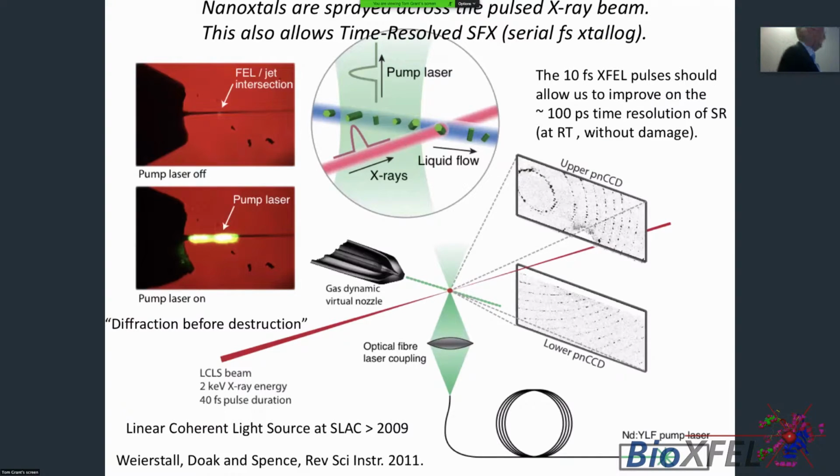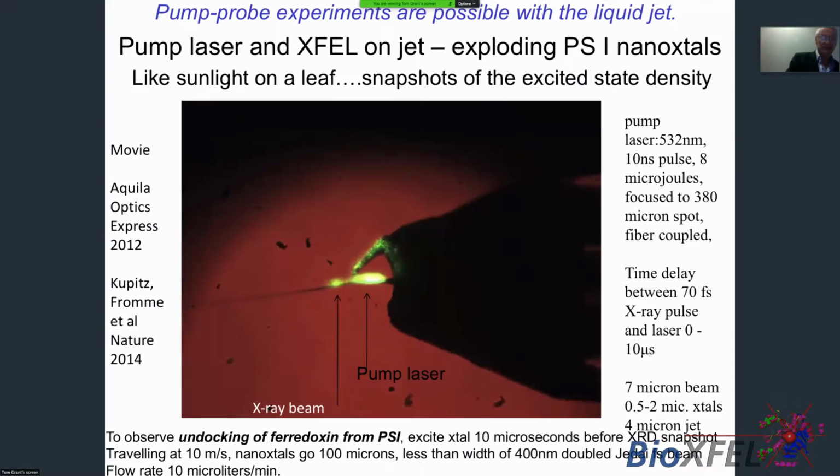So the technology for that was developed a few years ago. It's shown here. We use a light beam to excite molecules traveling along a liquid jet here. After excitation, we take their X-ray snapshot further downstream at this point. And that's using the sample delivery system I showed earlier. And here's the pump laser, so this is called pump probe. And it's been a very complicated system to set up, and there have now been many papers published on this, in which Marius has been a leader.